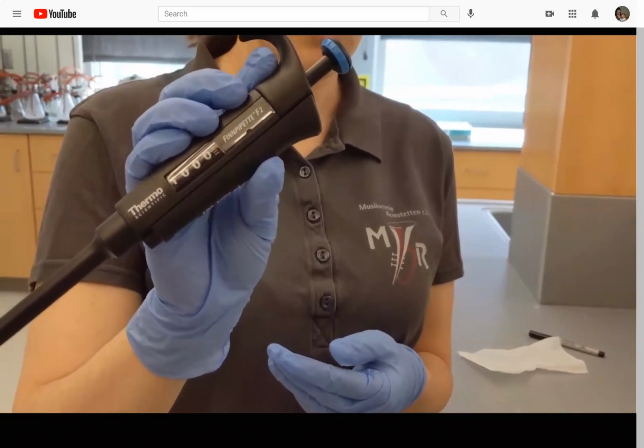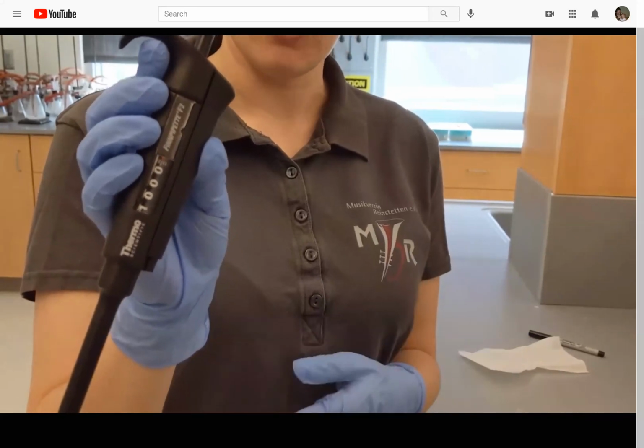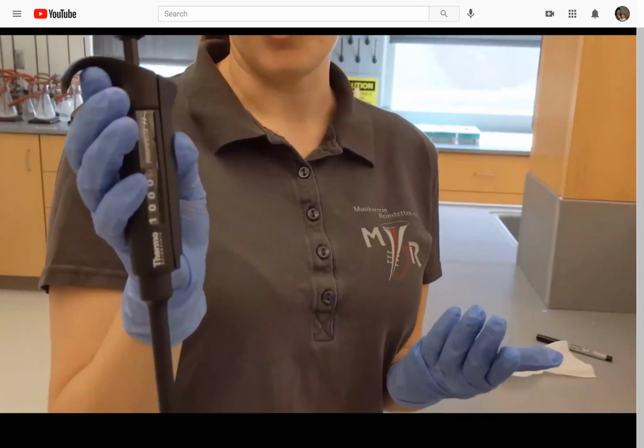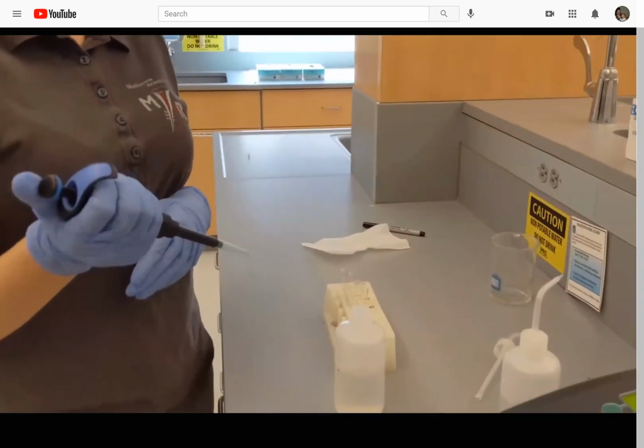These pipettes do come in different amounts or different ranges. This one will measure up to 1,000 microliters. Some only measure up to 200 microliters. You'd use the appropriate one for what you were doing. For today, we're going to use the 1,000 microliter pipette.